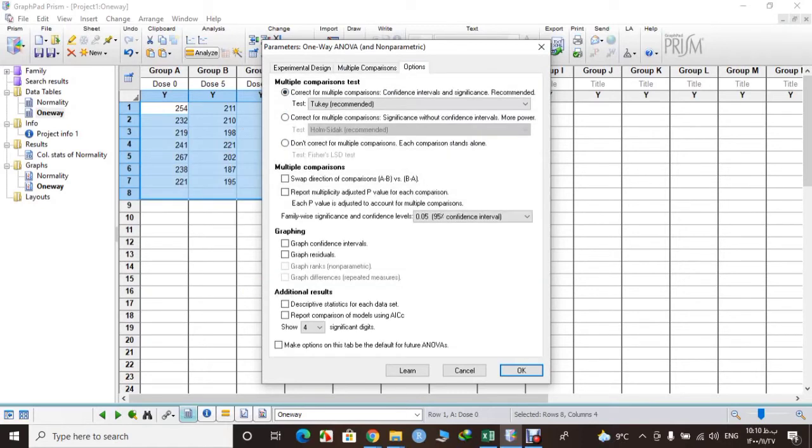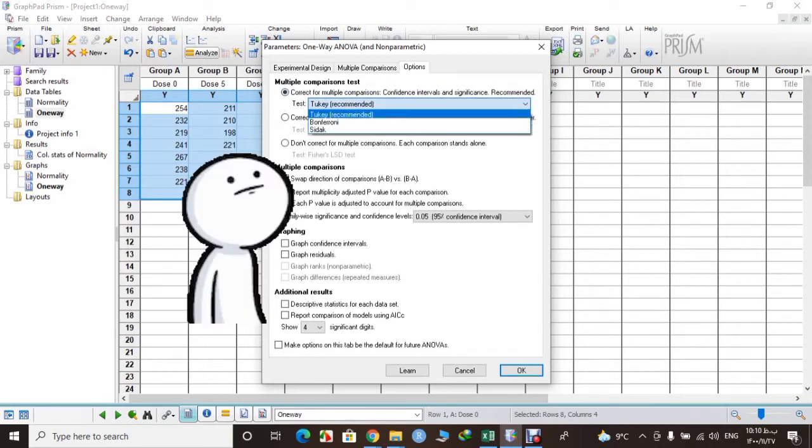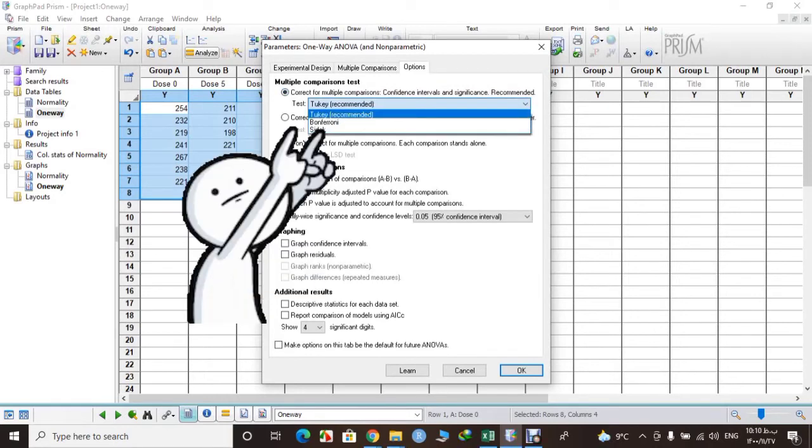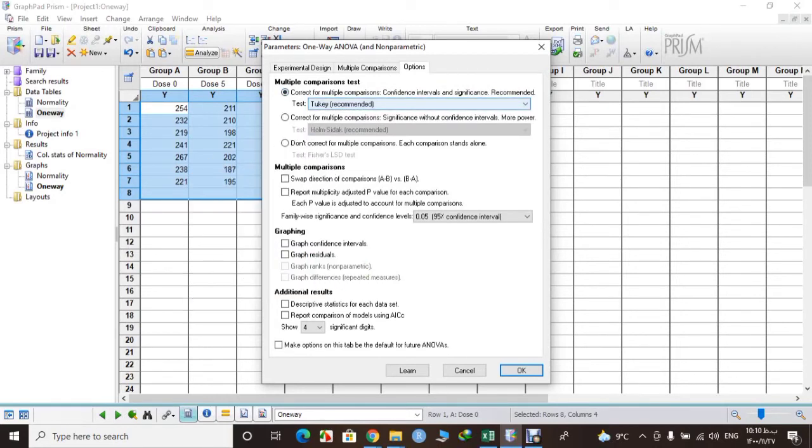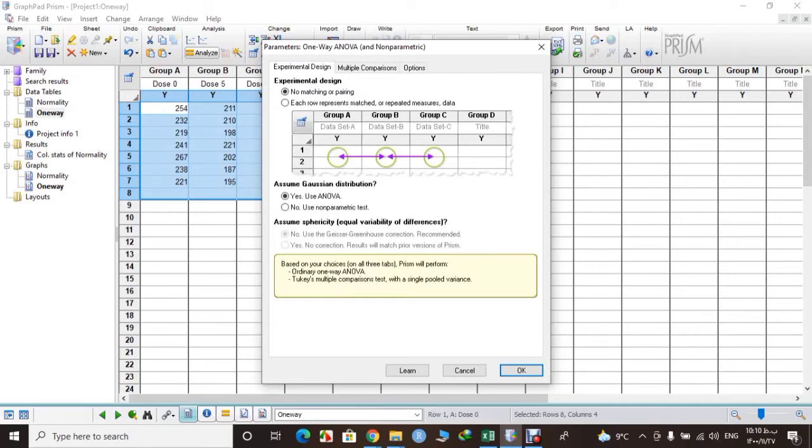And in options we will select the recommended test which is Tukey here. So let's check again. Okay, don't change anything else and just okay.